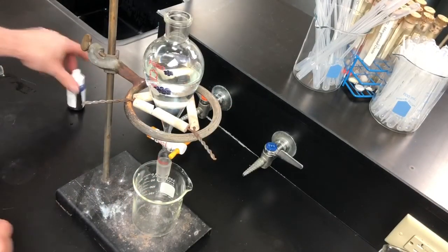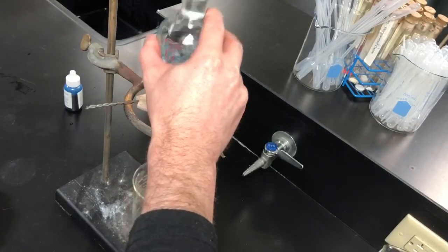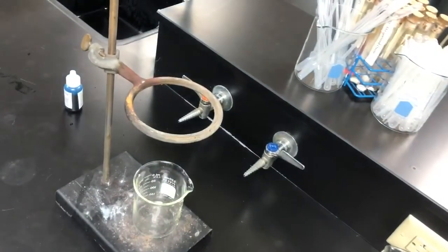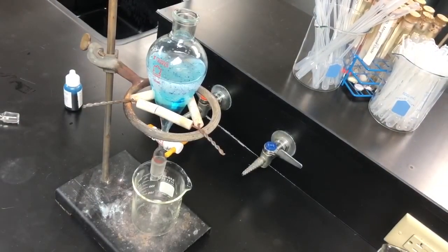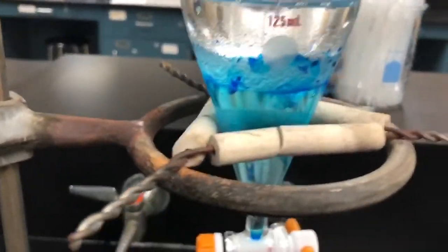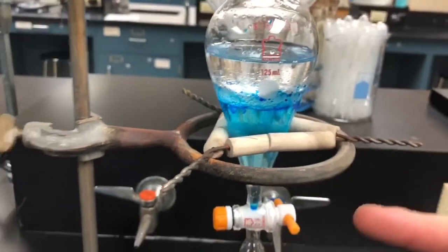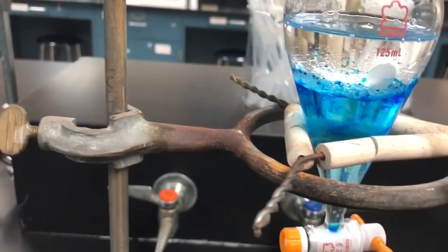Add a couple drops of food coloring, then put the cap on and shake it up to get everything mixed. Put the funnel back on the ring stand and take the cap off. Let it settle for a second. We can see two distinct layers: the baby oil is on top and the water is on the bottom. You can see the food coloring is migrating down to the bottom layer.